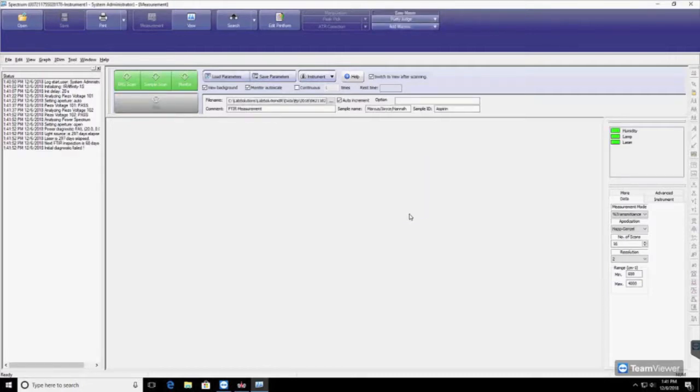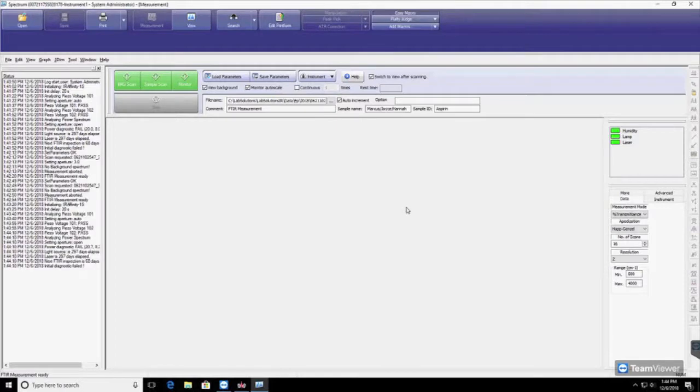Once the initialization is complete, perform a background scan by clicking on BKG Scan. An IR spectrum will appear. Click OK.